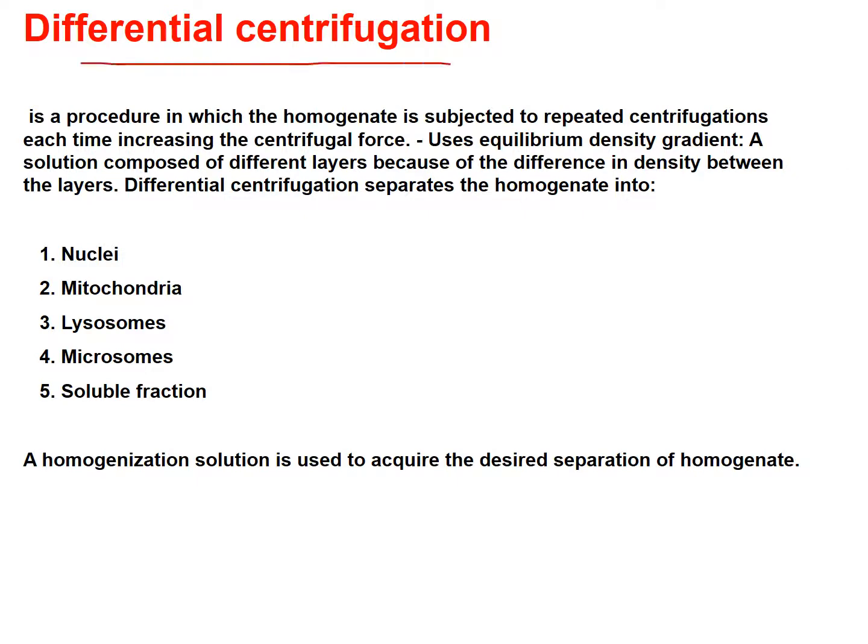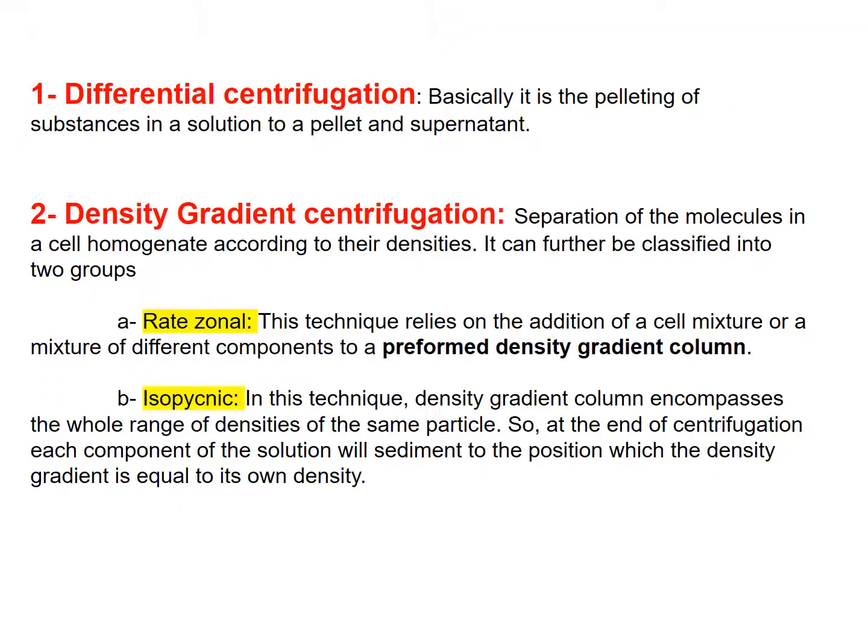So to remind you, differential centrifugation can get us organelles. We can do the various pellets and soups, increasing G-forces and time. We can get mitochondria, lysosomes, microsomes, and then the soluble proteins here. You have to have broken the cells up tenderly, neatly with protease inhibitors. Okay. And so you can break up into these fractions. So you pellet into pellet and soup, and you keep doing that.